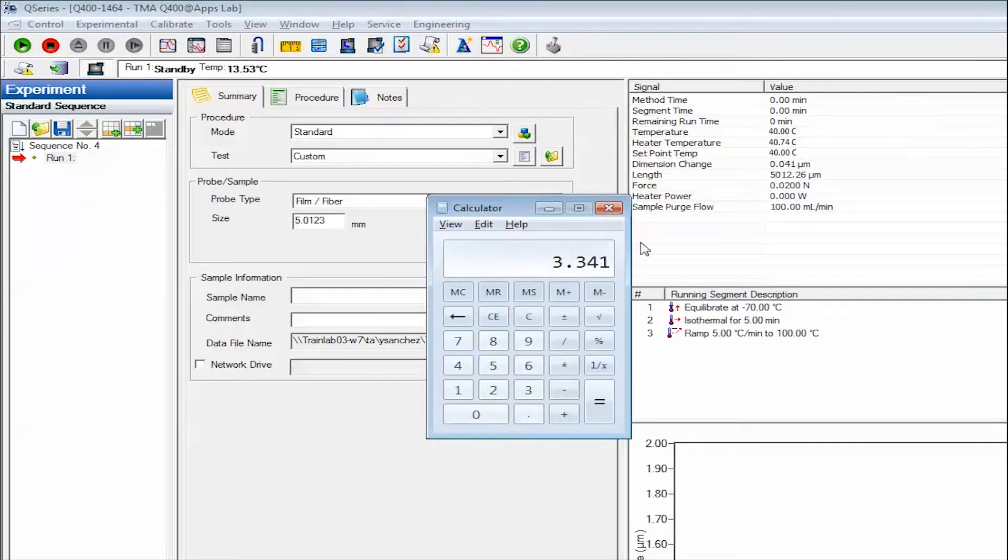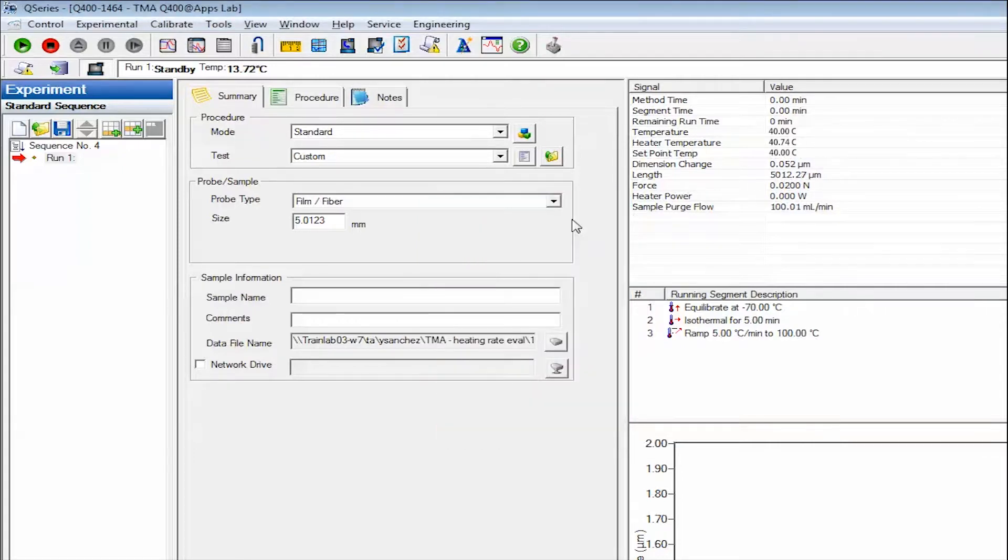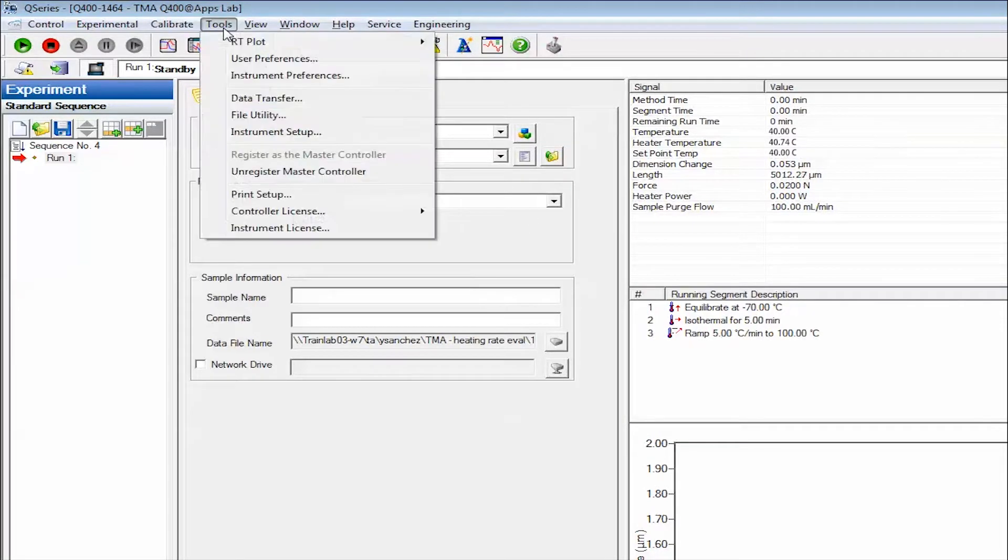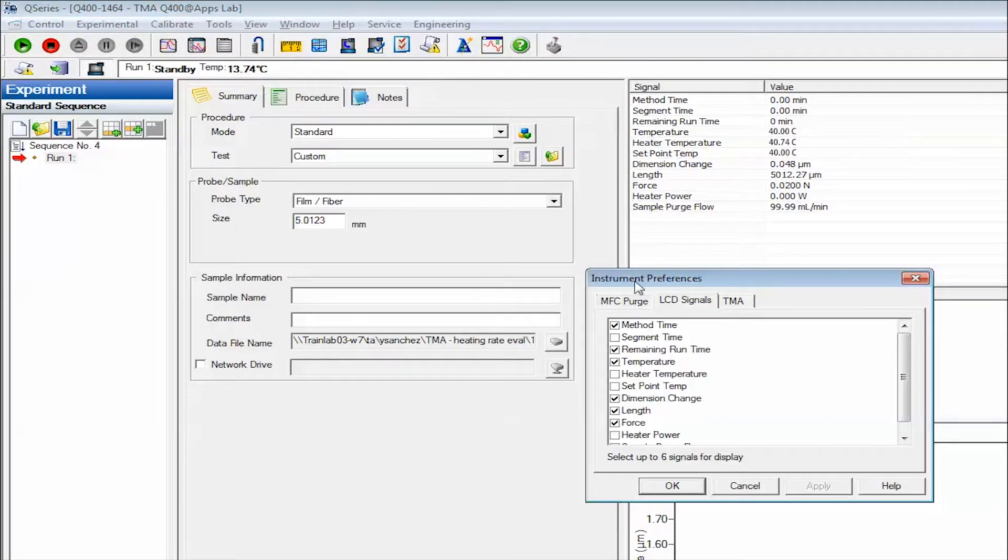Calculate the new offset by adding the old value plus the calibration fixture length, which is 5, and subtract the measured length. Enter the new AutoMeasure Offset value.